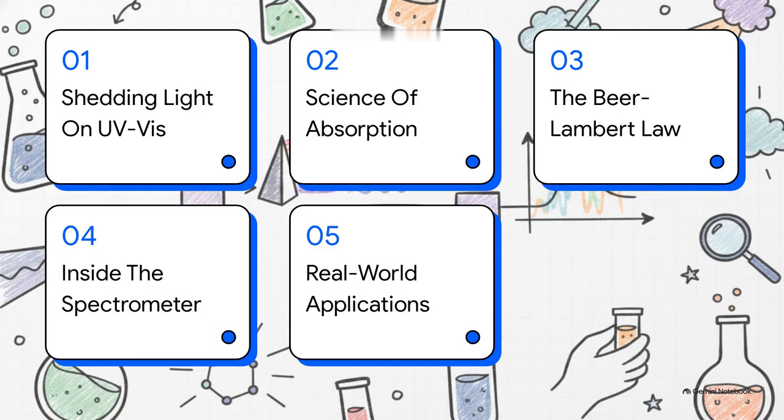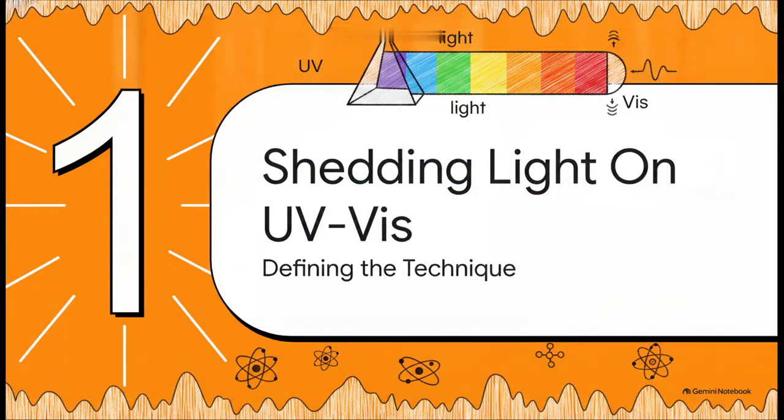We'll be shedding light on UV-Vis, diving into the science of absorption, decoding the Beer-Lambert law, taking a look inside the spectrometer itself, and finally exploring some real-world applications. Let's get right into it. Part 1. Shedding light on UV-Vis.